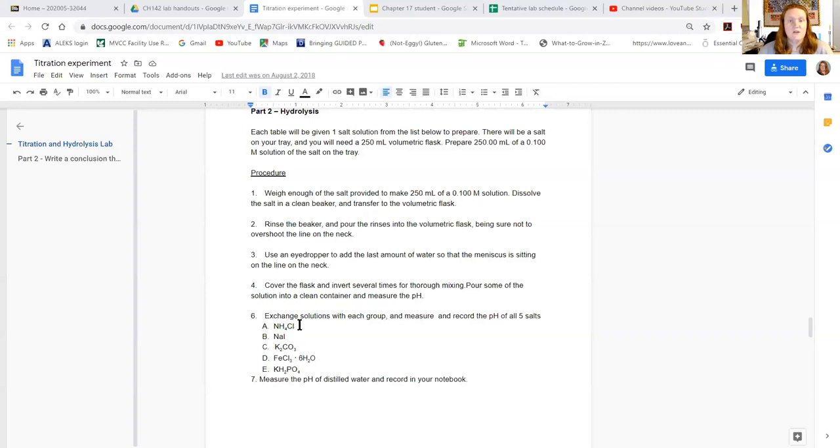Then what you need to do is take your 250 milliliter solution and put it into four clean test tubes so that once you have yours done, I'll distribute the test tubes to the other students so they can measure the pH of your solution and you will get the other four solutions to measure with your pH meter. Don't be shocked that the pHs aren't identical from one instrument to another. That is normal. Okay. So that's our plan.